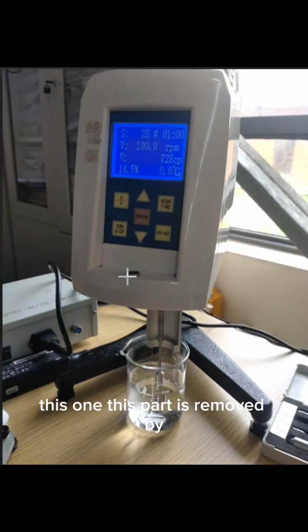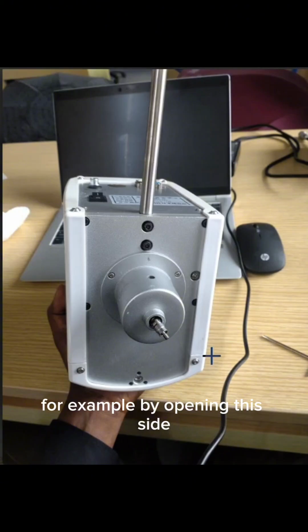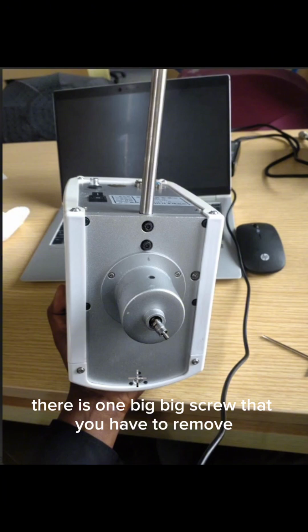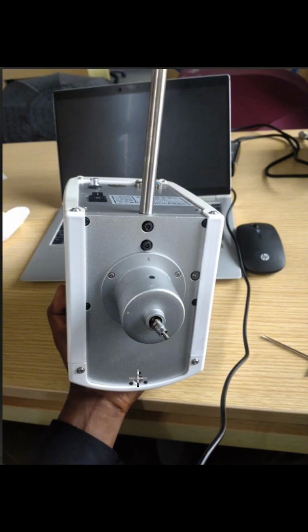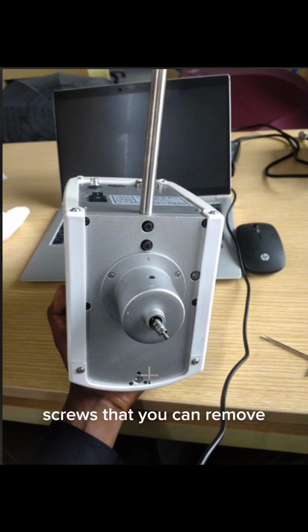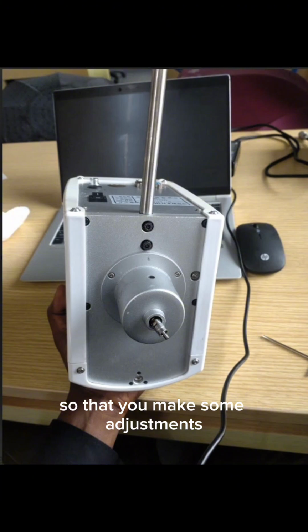This part is removed by opening this side. There is one big screw that you have to remove, and inside it there are some other screws that you can remove in case you want to make some adjustments.